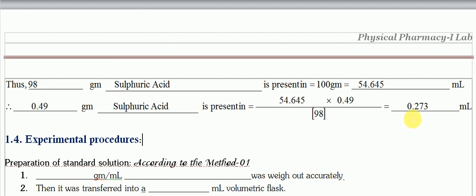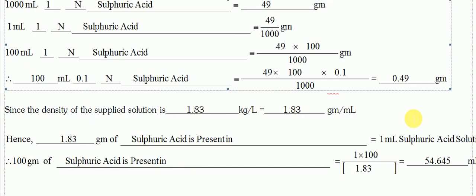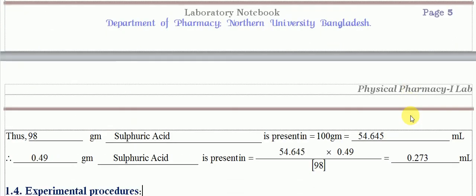That's all about the calculation, the mathematical formula, as well as the formatting of the laboratory manual and the data sheet for liquid and solid reagents. So we have understood the whole process.